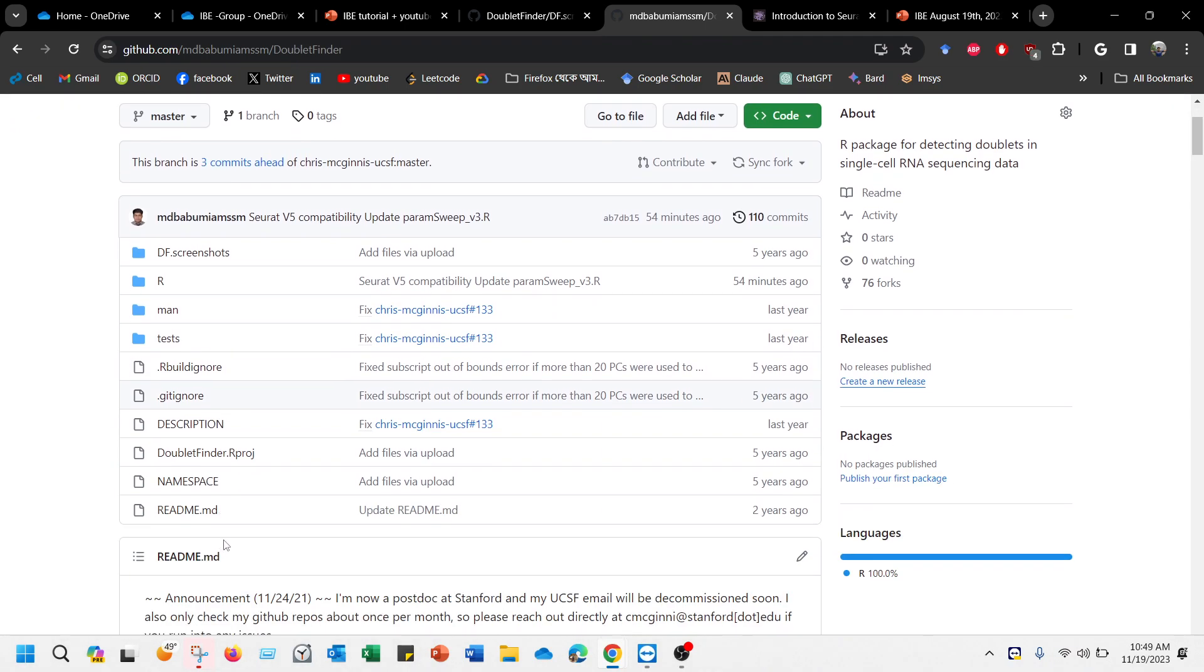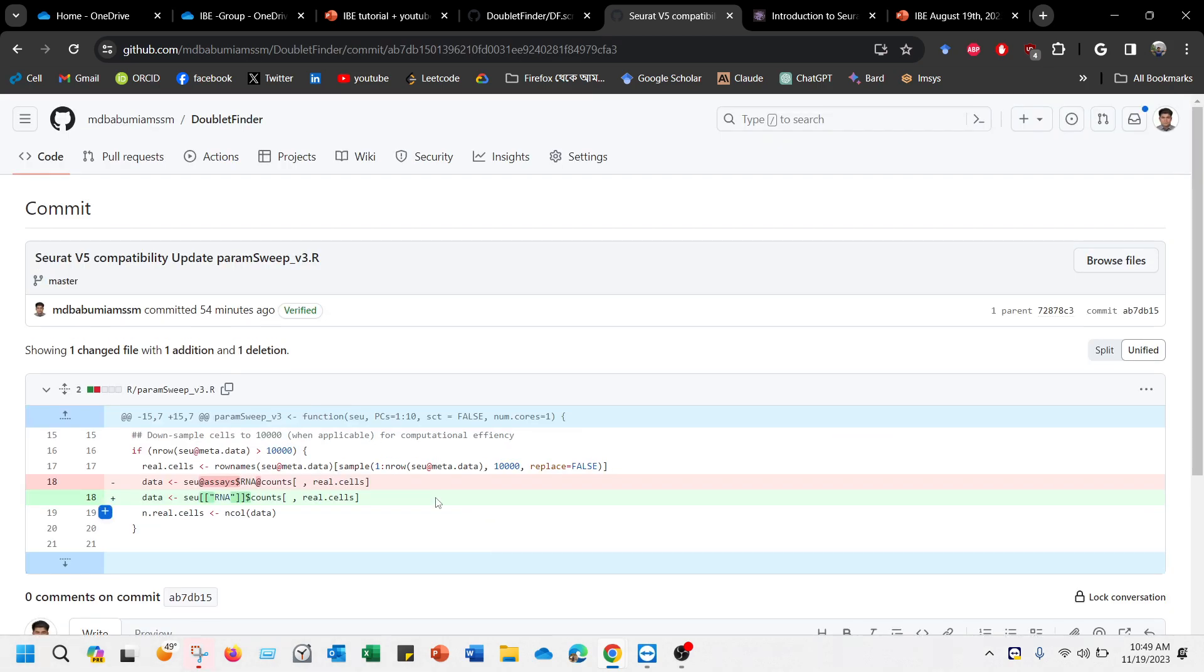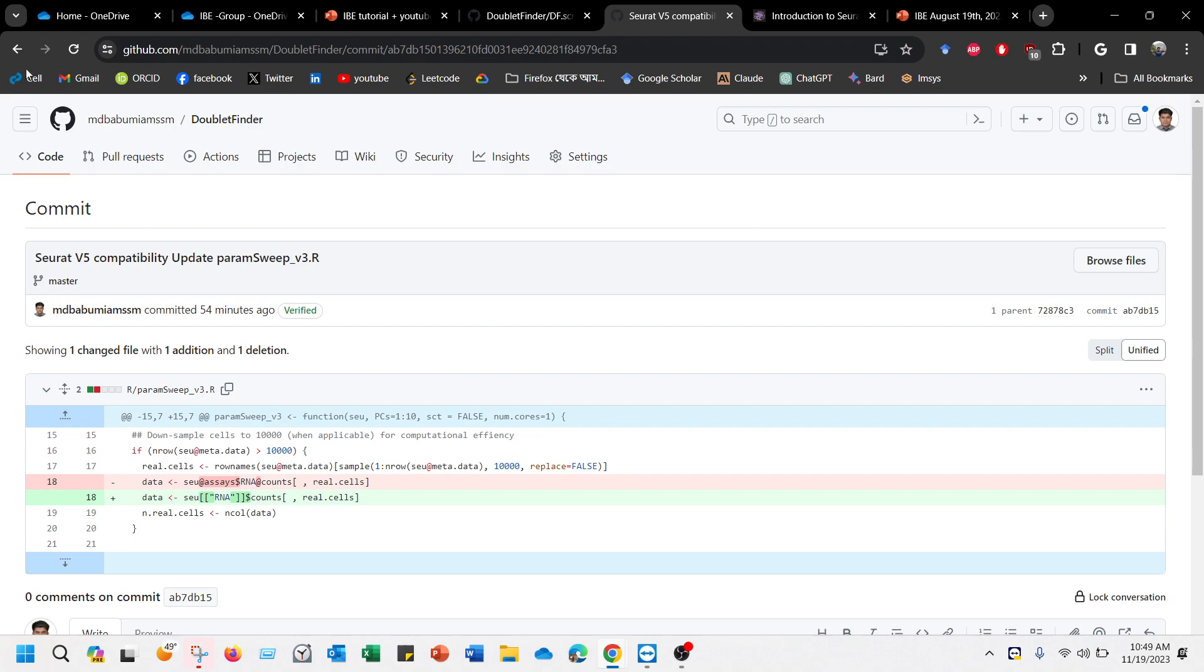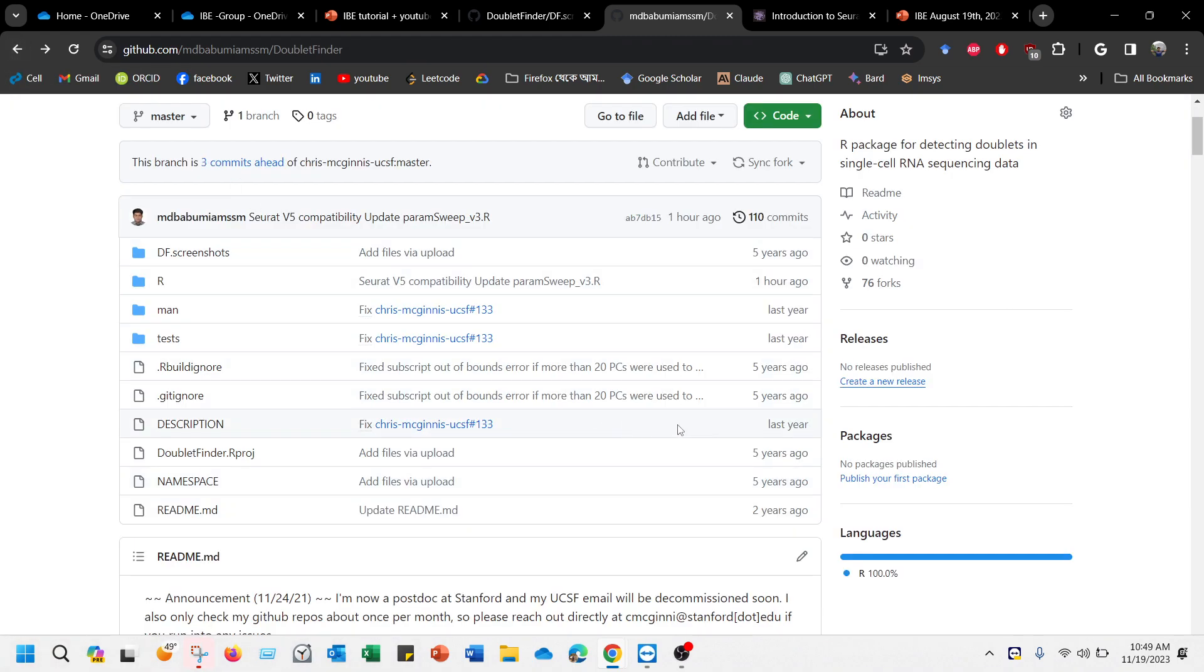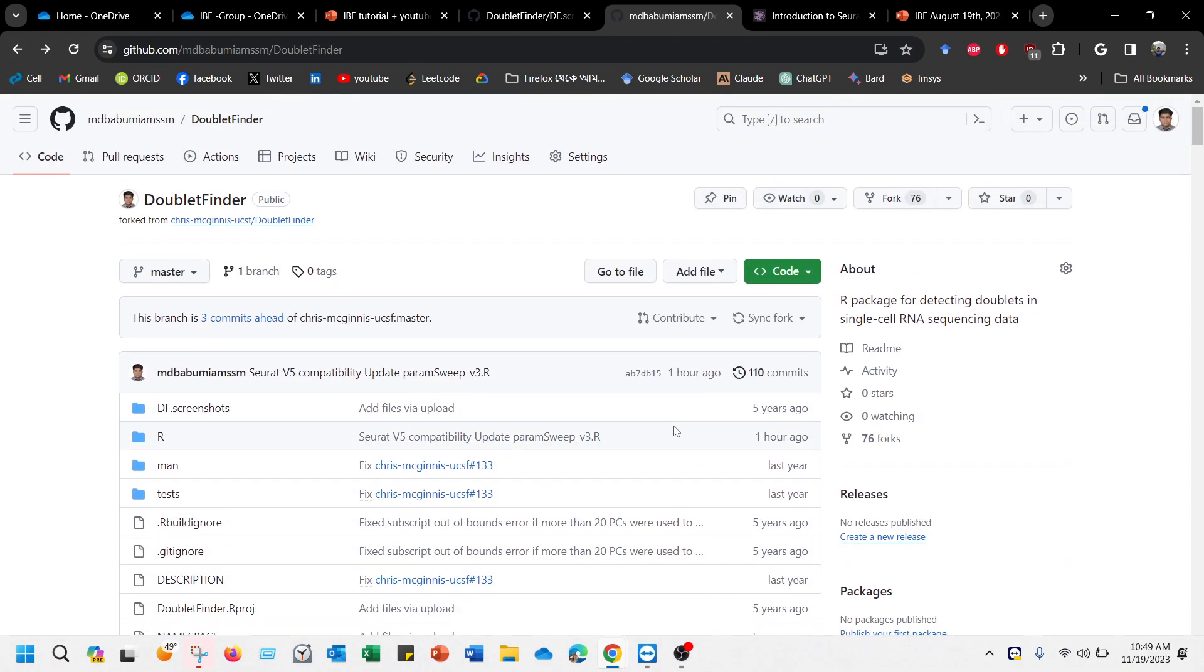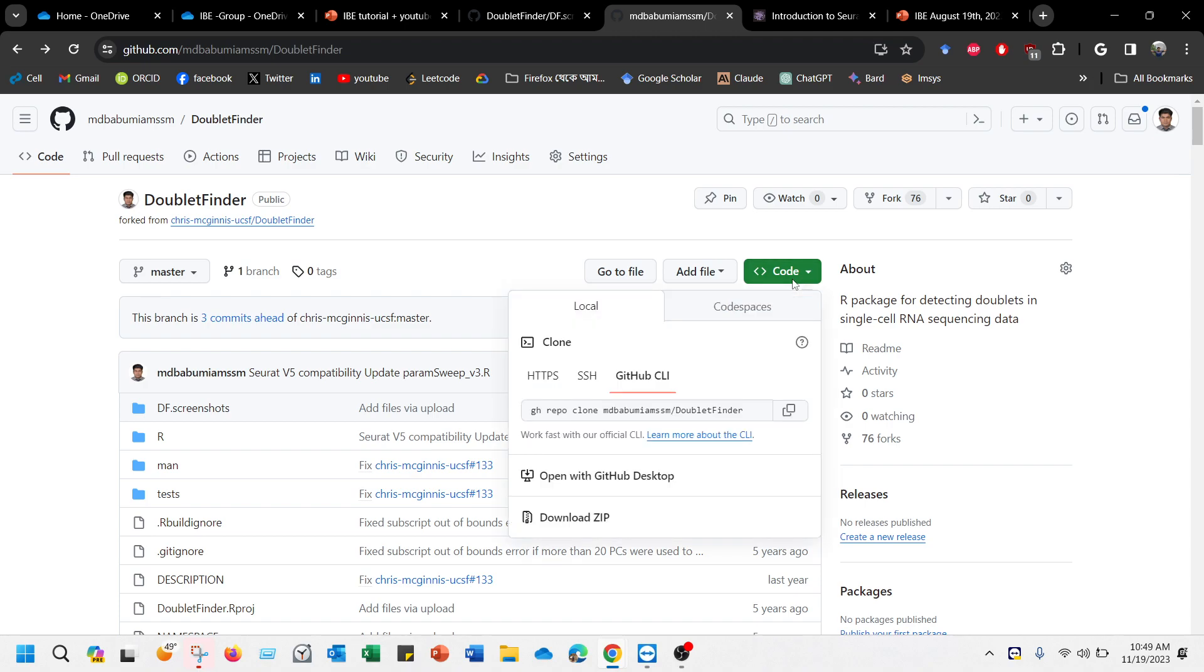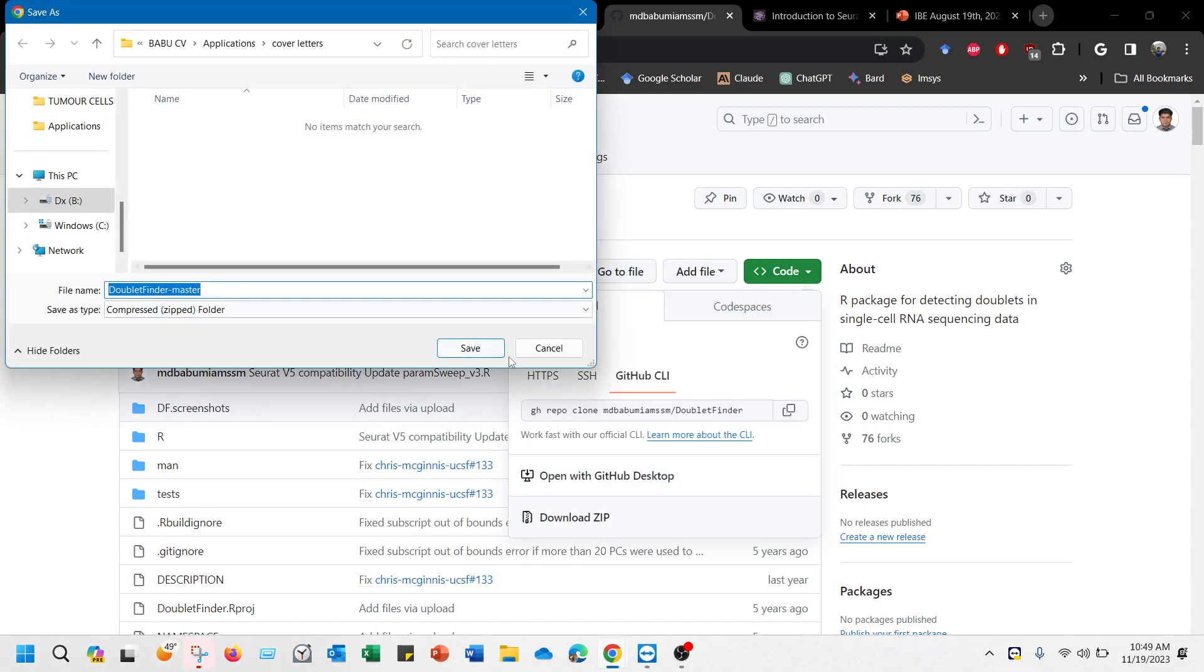Whatever the issue was, it's solved. So if you want to now use it without having any problem with your Seurat version 5, what you need to do is come to this GitHub account, then just download it.